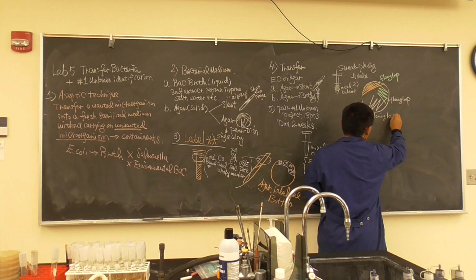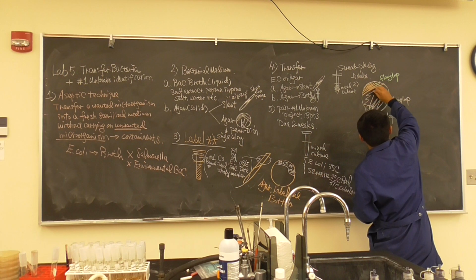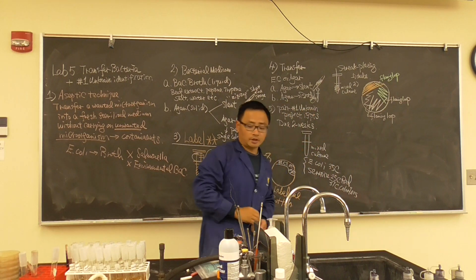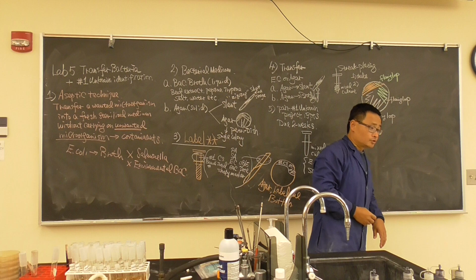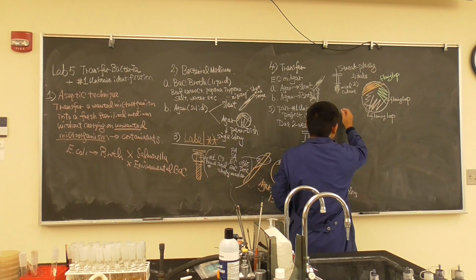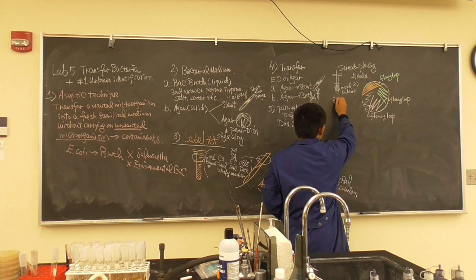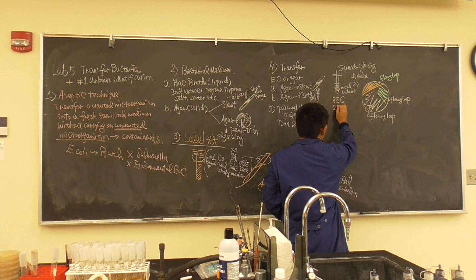Flame loop again, and then do a last one. Okay? Or you can just do 3 course, 3 course or 4 course, it's up to you. Then we will do an incubation, which is at 35 degrees Celsius. Another one will be at 25 degrees Celsius. This will be one of you.